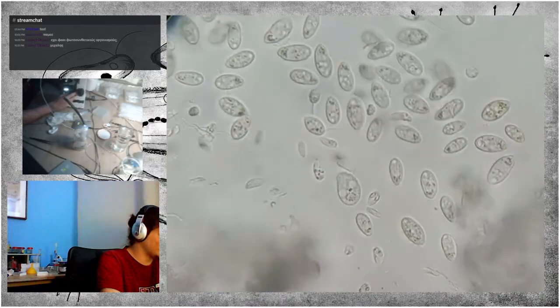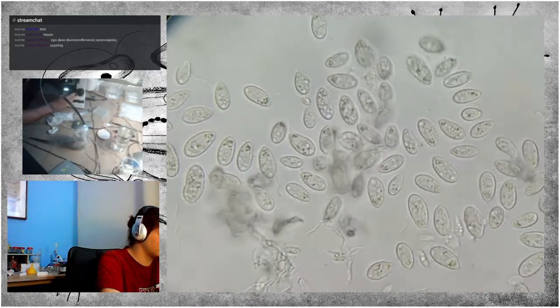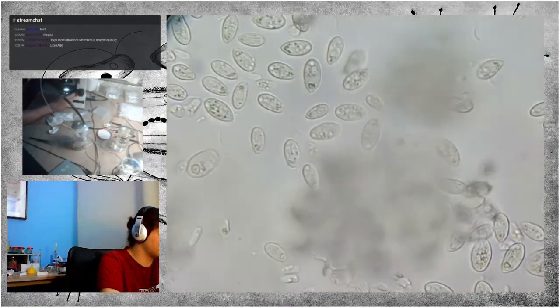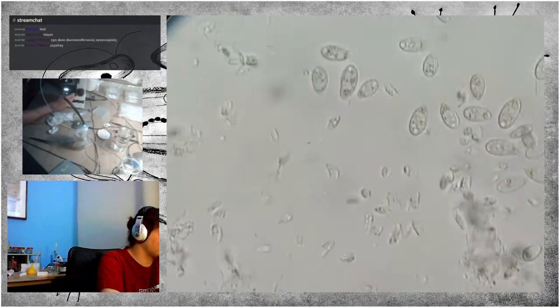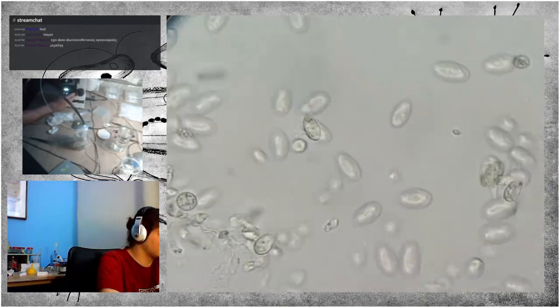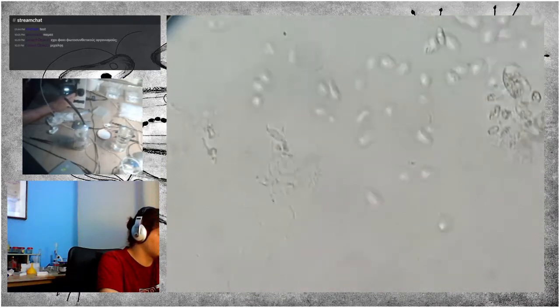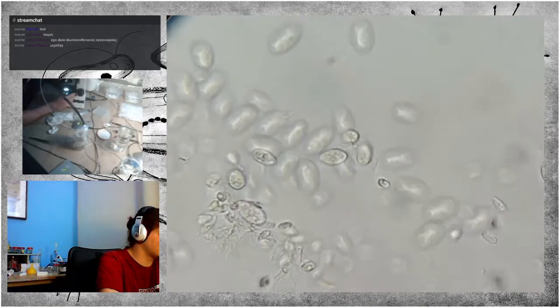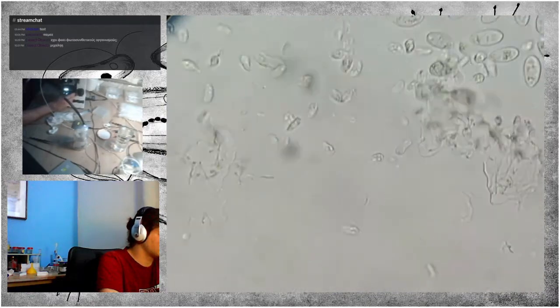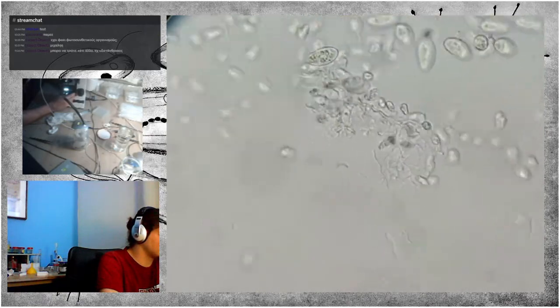I also don't know what to say about the huge concentration of ciliates here. And I'm surprised not seeing anything in the middle of conjugation here, or perhaps the... oh no, that's not a pair of conjugating ciliates. That's a pair of ciliates stuck in the... no, three of them, in a few spirochetes. Again, here's a mesh of the bacteria.